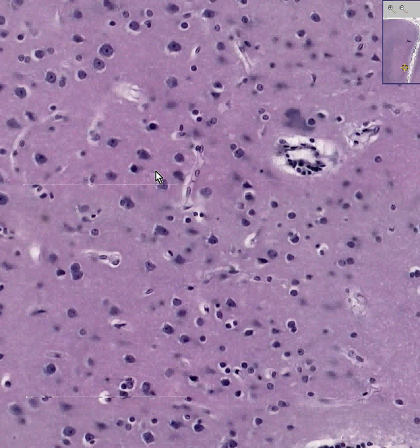And the difference, well, let's not talk about that yet. You know this is a blood vessel. You know there's a lot of neurons here. You know most of these small cells are glial cells. And let's go to now another area of the brain in which there are practically no neurons and practically all glial cells.